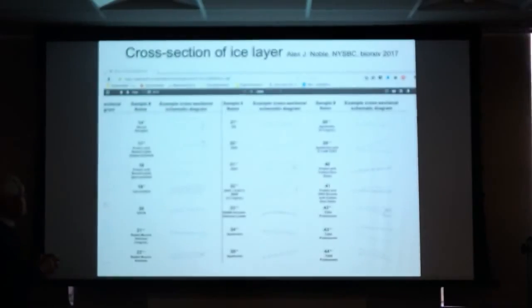But that notion has been really dispelled by very careful studies here at this place by Alex Noble, and he did a tomographic reconstruction of the grid itself in order to look at where exactly molecules are situated, and he found that in most cases they're simply sitting at the top or at the bottom, so they like to sit at the air-water interface. And that brings up questions: can we trust the structure that we get out? How many molecules are actually still in the original state?